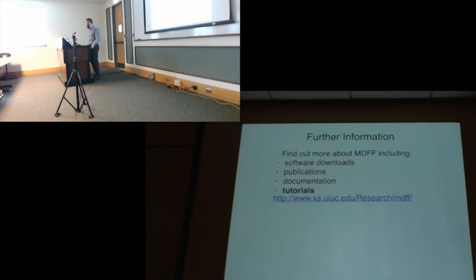Yes. And about cross correlation calculations, you can set a threshold. But my question is, the algorithm behind it, will it cut the local map out of the whole map and calculate the cross correlation, or still use the whole map, but do something with the rest of the map to make it 0 or something? So correlation is undefined if you have 0.